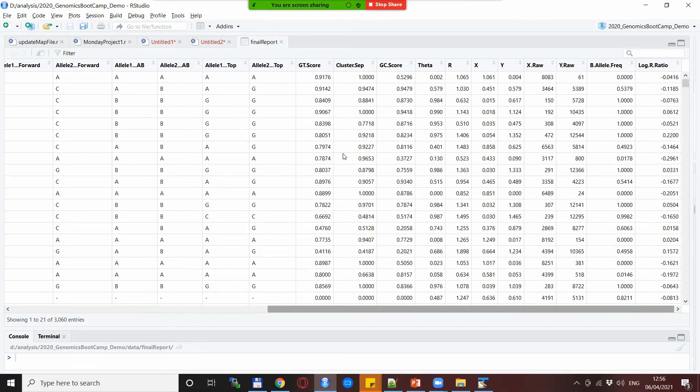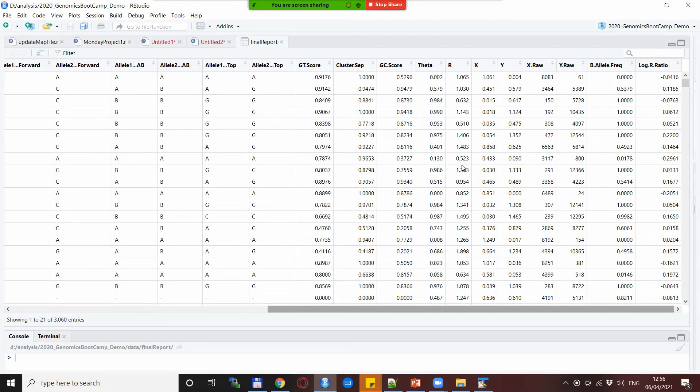The third thing I want to show you in this video are two other metrics that are also included in the final report and this is the so-called B allele frequency and the log R ratio. Now these are two very interesting statistics that allow you to analyze copy number variations from the SNP data.